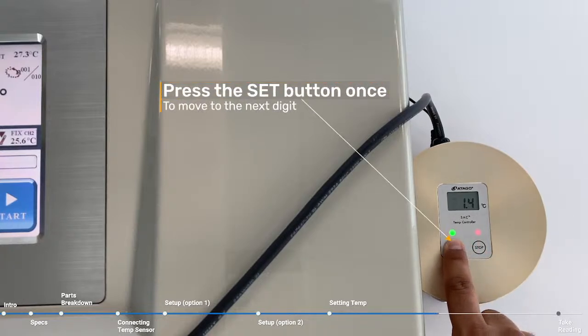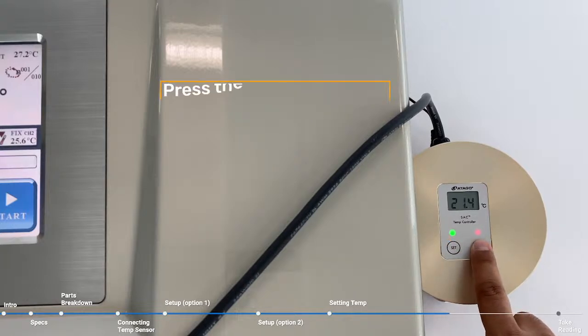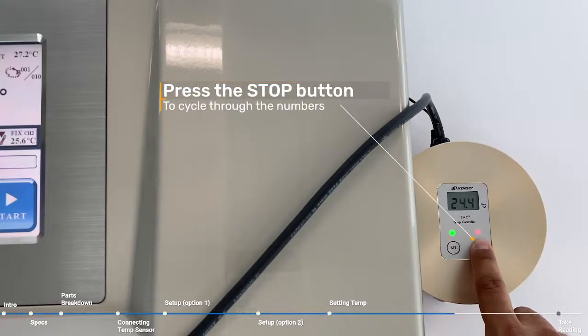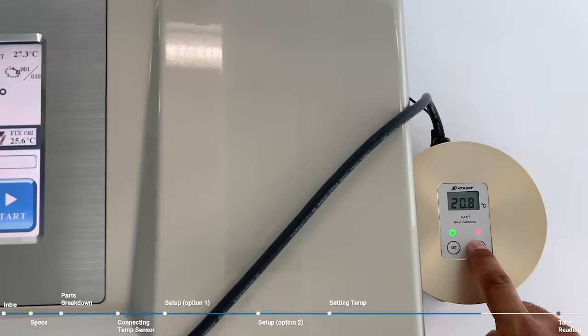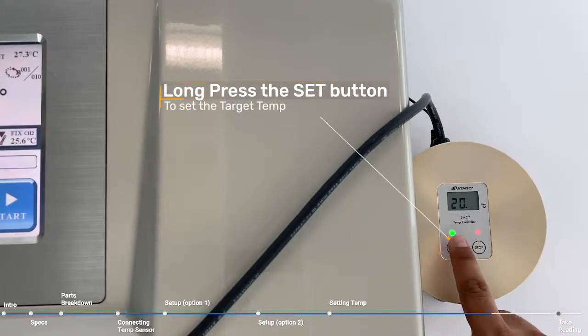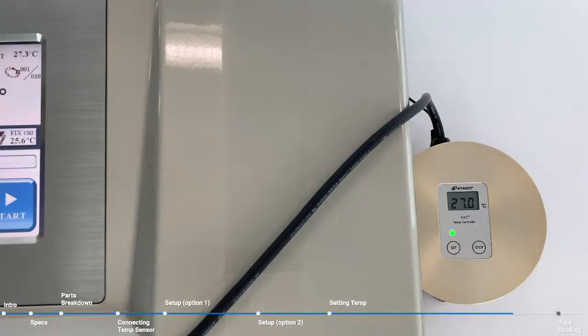Okay, so let's say you want the sample at 20, but my room temperature is maybe 25. So I might need to set my temperature controller at 18 or 19, 19.5, so that my sample is 20. If your room is 20, then the temperature controller might only need to be 20. So it all depends on the ambient temperature and how the ambient temperature affects the sample or the reading.